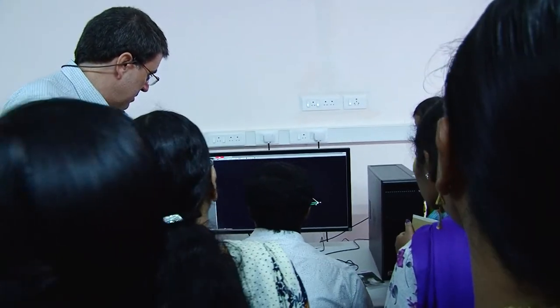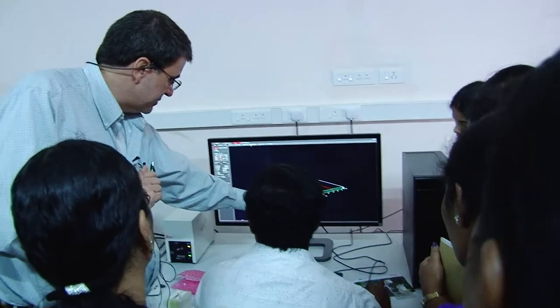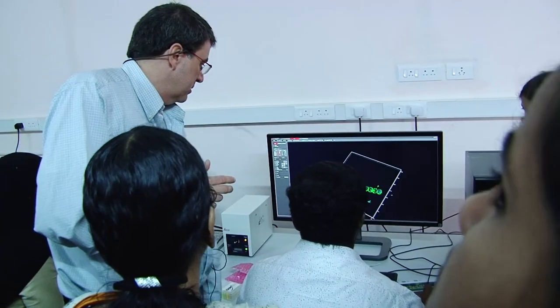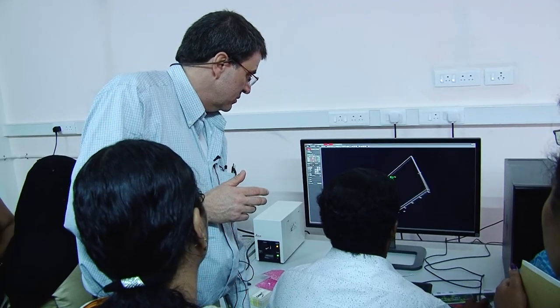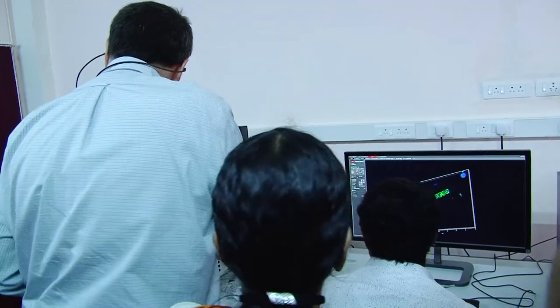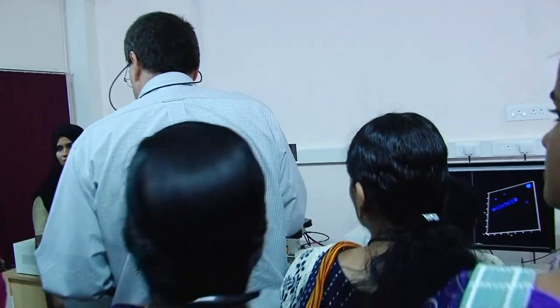And let's just take a look at the 3D of it. See, nice and clean and crisp, and the averaging is really the trick, though, okay? Okay, somebody else want to try one? Somebody else? Jump. Everybody's jumping. Okay.